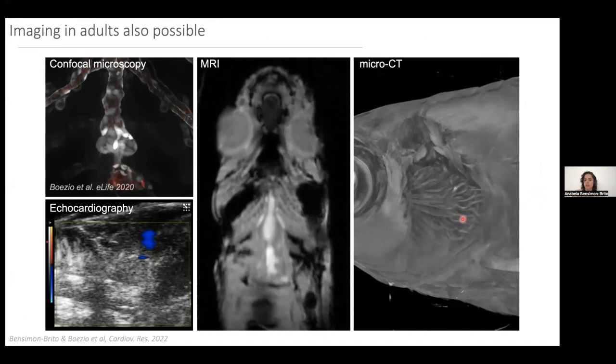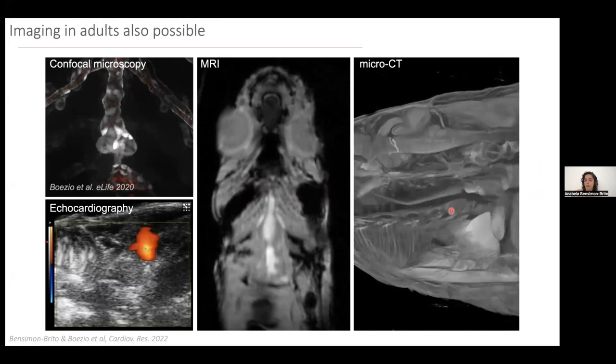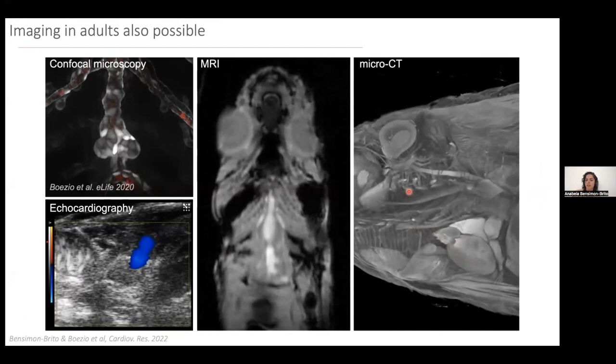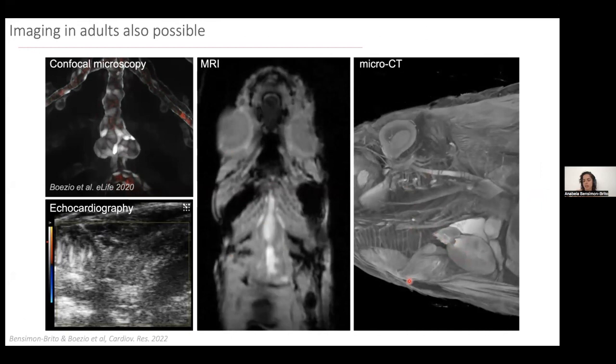Here you can see an animal imaged with micro-computed tomography, which is X-ray based. This is a dead fish — all others shown are living fish. You can actually see the heart, the ventricle, and the vessels connected to the ventricle. You see quite a lot of detail with high resolution using this kind of approach, even in adult animals that are no longer transparent.